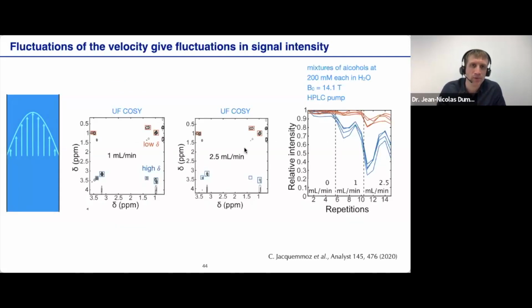And again, you can see here experimental data where the spectra look good, but the volume of the peak as a function of time is not repeatable, so they are essentially useless. These are obtained with spatial parallelization along the z-axis, because this is what we would normally do. That is what provides the highest resolution in the indirect time dimension.